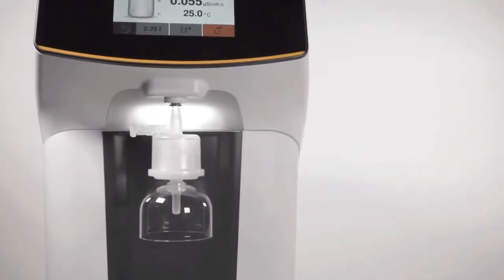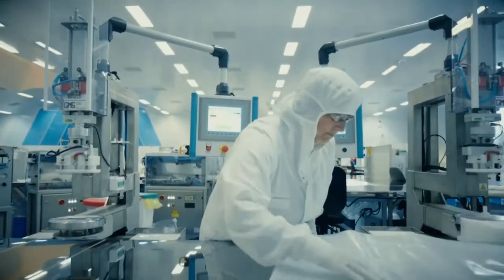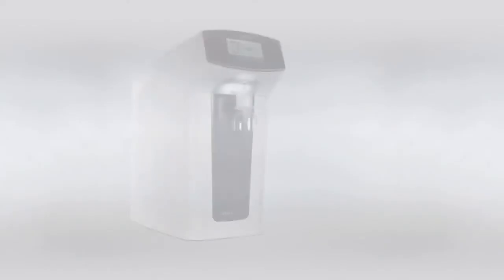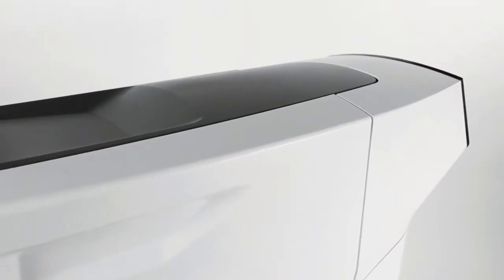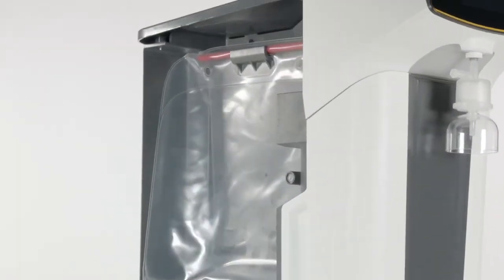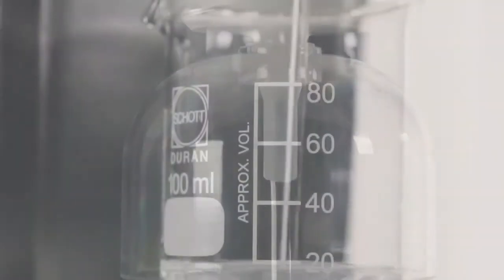The UltraPure Water System Arium Mini combines Sartorius' pioneering expertise in manufacturing biopharma disposables and the well-known performance of its water purification systems. The closed bag tank system and optimal storage in Sartorius single-use bags guarantee the highest water quality. Therefore, this lab water system delivers the most reliable results.